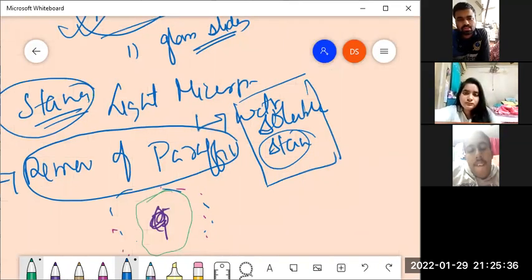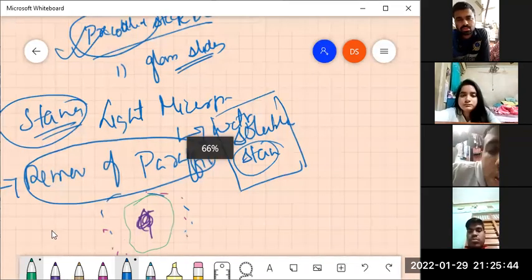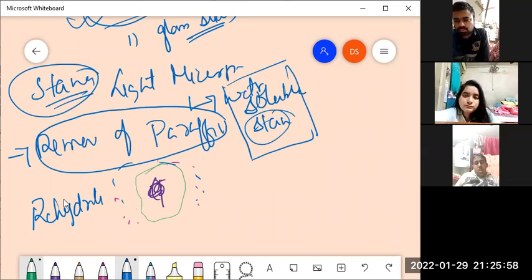Now, after the removal of the paraffin, what do you need to do? In cases, sometimes we do again need to rehydrate. You might be confused that if you are rehydrating, why in the previous step we dehydrated the tissue? The previous step of dehydration had another purpose.